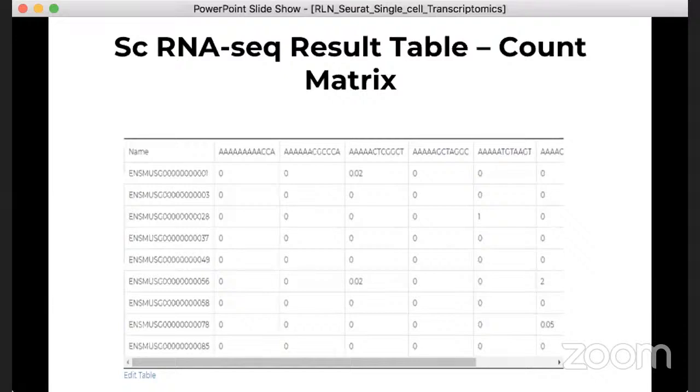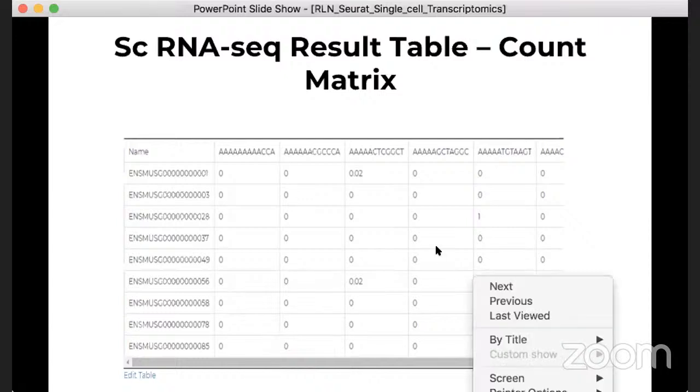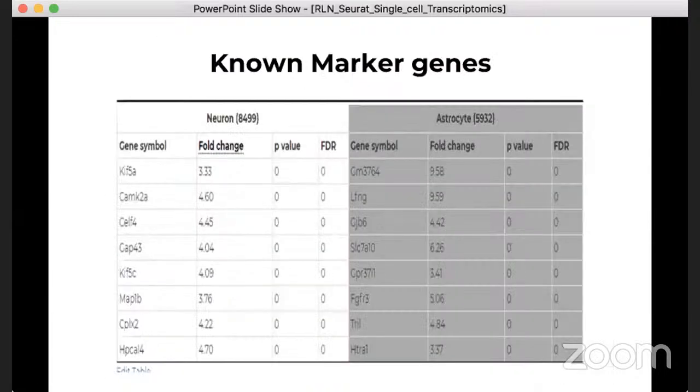Since this table is sparse and includes lots of zeros, and there is a general asymmetry in the expression level of these genes across different cells, many of the analysis techniques that we are going to use will be non-parametric and non-linear techniques or non-linear algorithms.